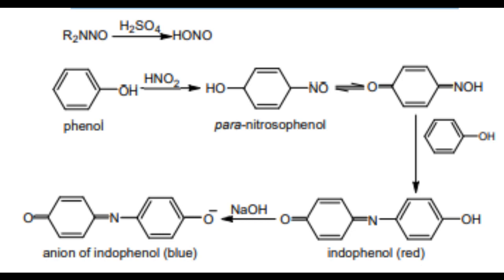In the alkaline hydrolysis of the amide, the sodium salt of the carboxylic acid is obtained along with the evolution of ammonia as shown in the above reaction. The carboxylic acid can then be liberated from its sodium salt by acidification. The carboxylic acid so obtained can then be identified by performing the test for carboxylic acid as given in B. 3. Compounds containing halogens.